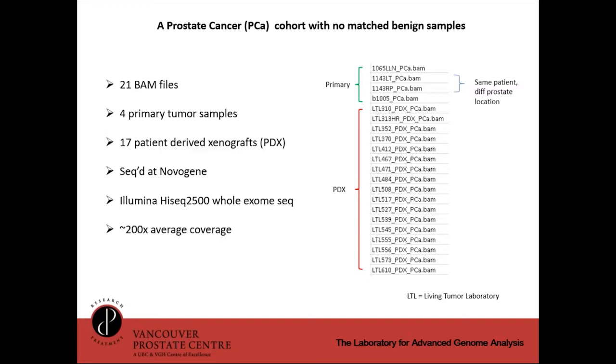These were sequenced at Novogene on Illumina HiSeq whole exome with approximately 200x average coverage. And if you see in the xenografts here an LTL in front, that's the name of our xenograft program called the Living Tumor Laboratory, headed up by Dr. YZ Wang.